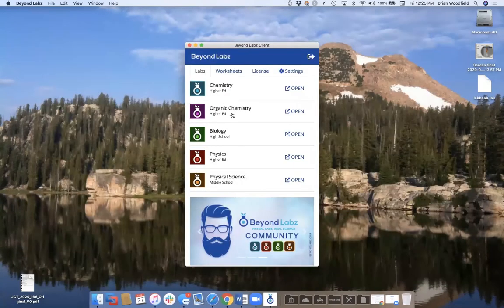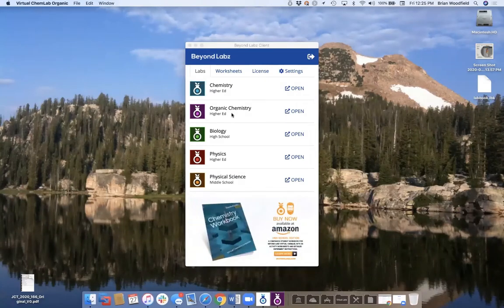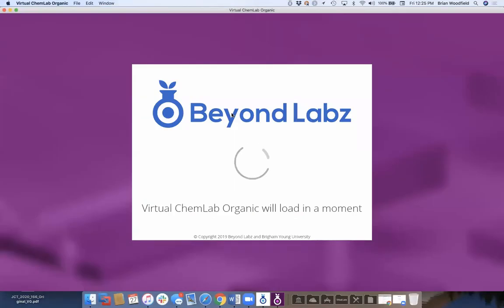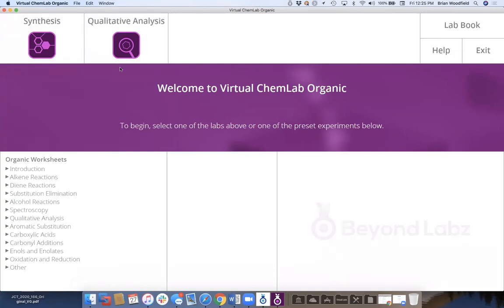Same idea for organic chemistry — lab benches, each completely open-ended, worksheets with presets, a lab book, and help files. They're detailed on how to use everything. Organic chemistry is divided into synthesis and qualitative analysis.